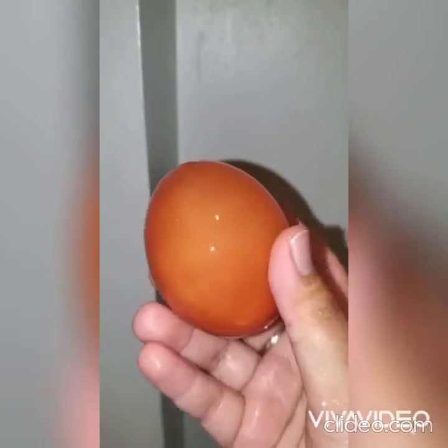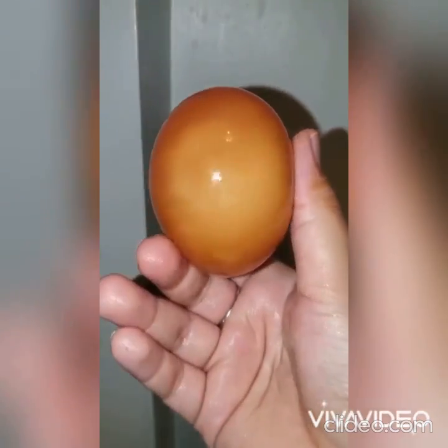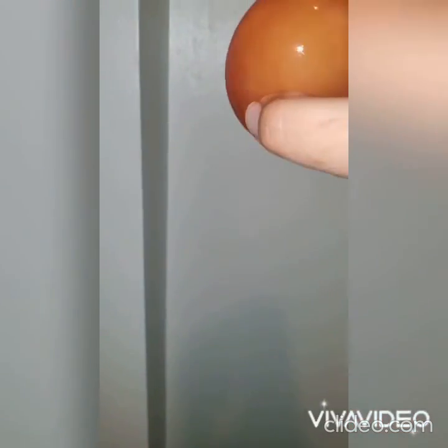Another interesting observation is that we can see this egg yolk almost floating inside the water through this membrane.